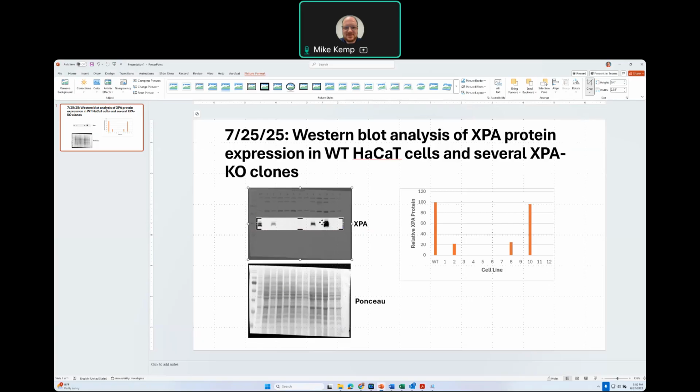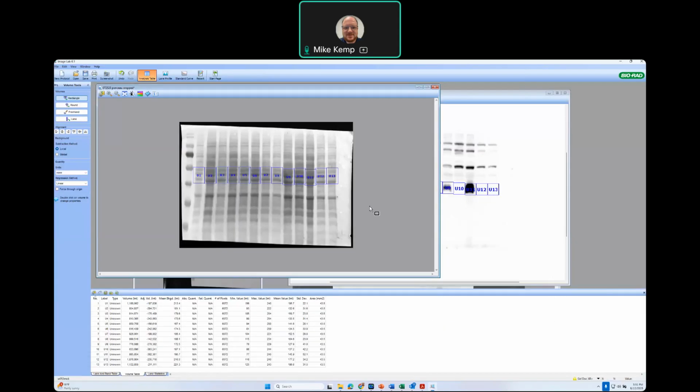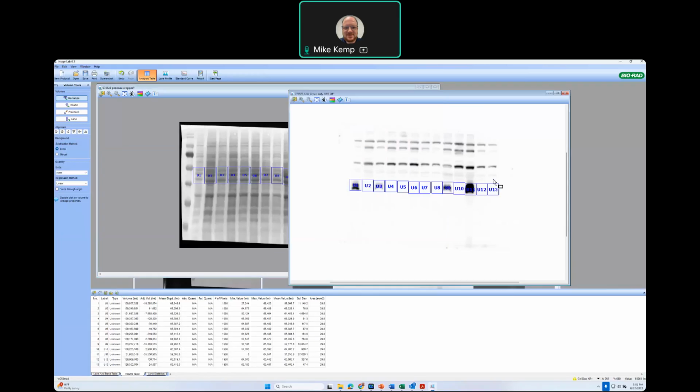Sometimes in supplementary information, which journals will require, they want the full blot, nothing cropped, because they want the original data. The science is changing a bit in that it's becoming more common that essentially all your primary data needs to be reported. Make them do that, because it makes it easier for people to see what you actually did, and not like you're trying to hide something. Again, that's a way to use ImageLab to quantify Western blot data, export the quantitation, the densitometry, into Excel, and then present the data in a PowerPoint slide.